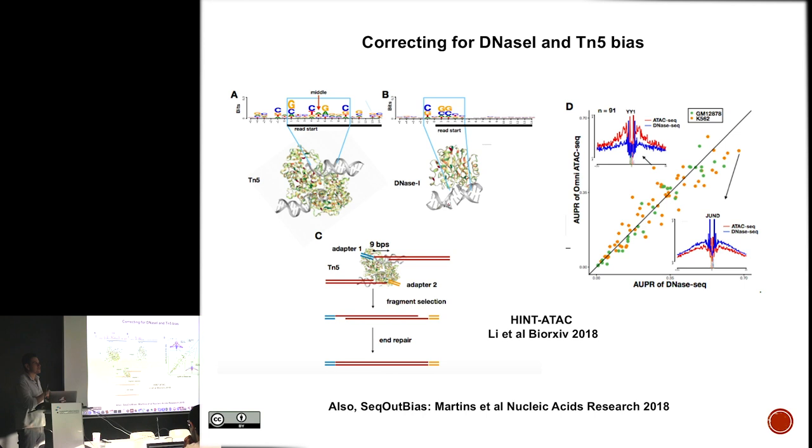And actually doing true differential footprinting is something that's hard to do. So how do you compare the kinetics or differences of footprints? And I think that would have a tremendous impact on the networks. So false negatives is, yeah, a big one. That's a big thing with footprinting, is the false negative rate.